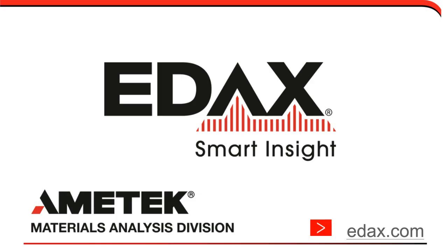One point, I'm seeing several questions about SSDs. I'm sorry, I must not have explained that well. SSDs will not produce local misorientations. Basically, you have rotations that are canceling each other out, and so EBSD will not pick up SSDs. You will see it in the quality of the patterns, but that's a little harder to be quantitative about. And so SSDs are something we miss. What we do pick up are the GNDs. So that is something that you should be aware of.